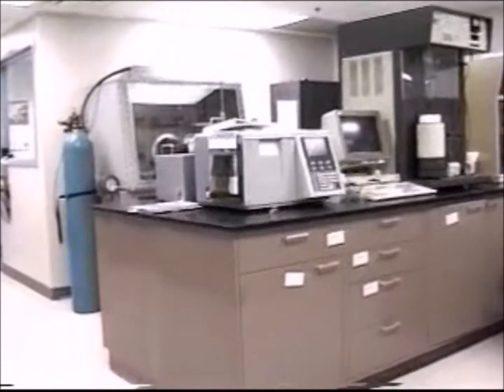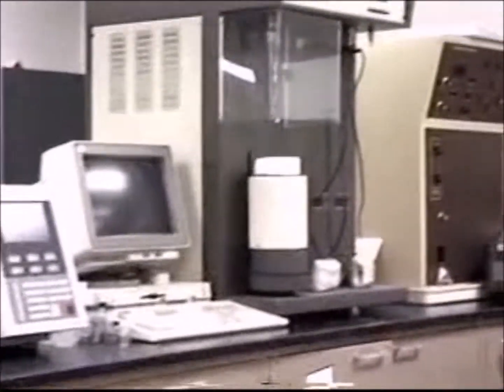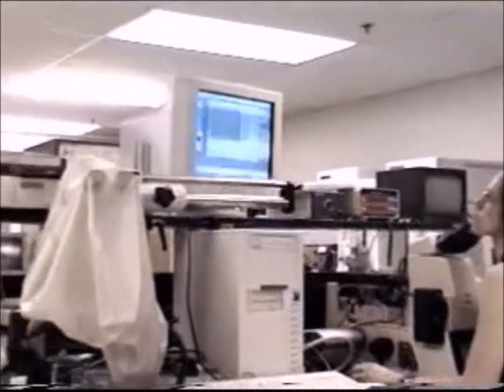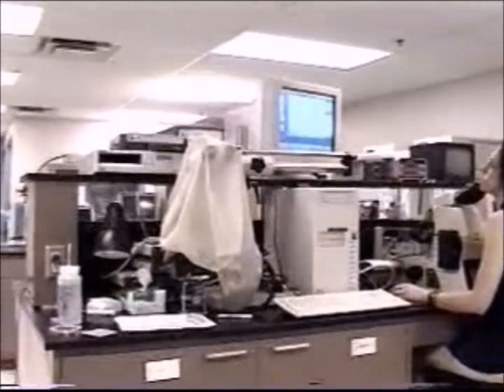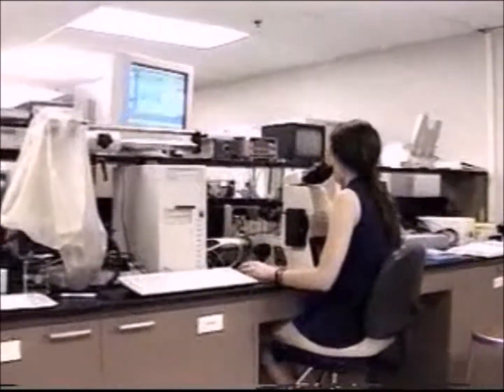This is sedimentation particle sizing equipment using the Stokes law principle. Open and interconnected pores inside powders and parts are measured using mercury porosimeters. And an inverted stage microscope with attached digital camera is useful for capturing images of samples prepared metallographically.